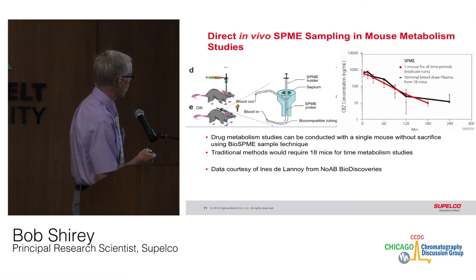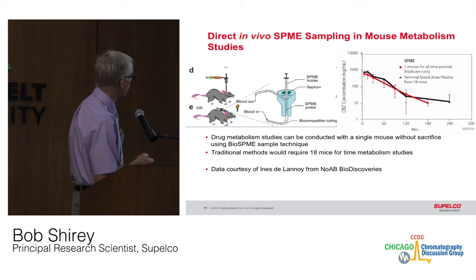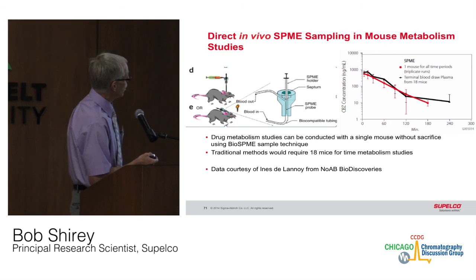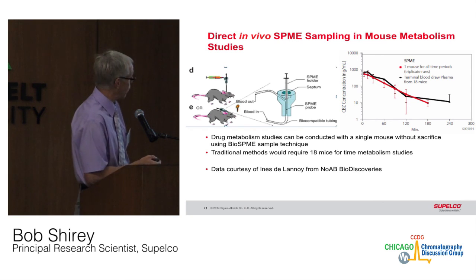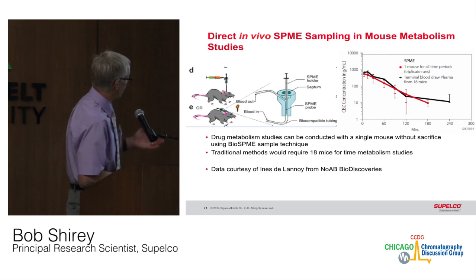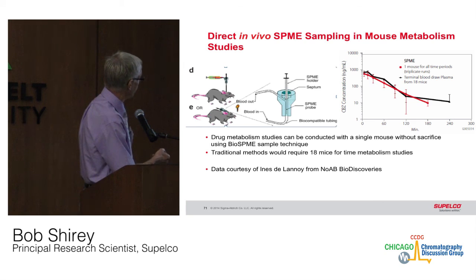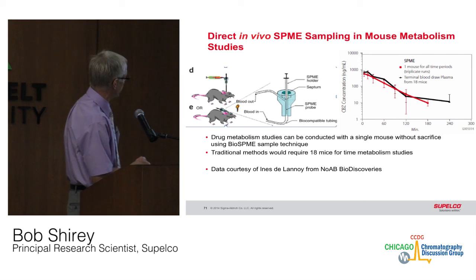have to kill multiple mice because they remove 2 mLs of blood from the mouse, which kills it, and then they do the analysis. And to do this one study, they usually take anywhere from 8 to 12 points, and you like to have 3 replicates at each point. So that could involve up to 36 mice. And if you're using transgenic mice, that can be very expensive, let alone the ethics of euthanizing so many rats or mice.